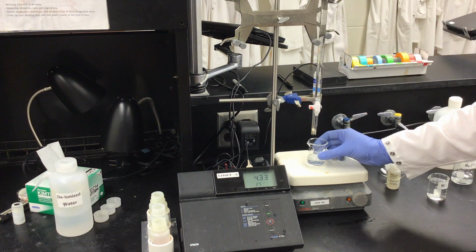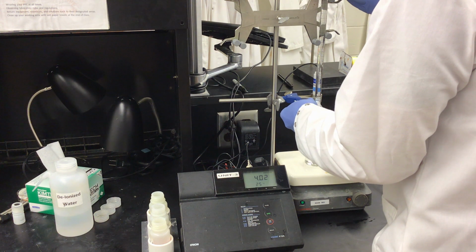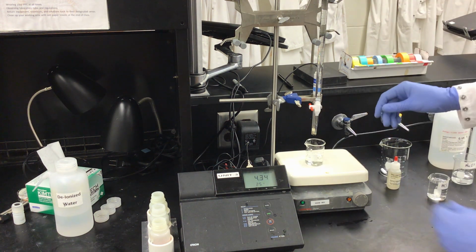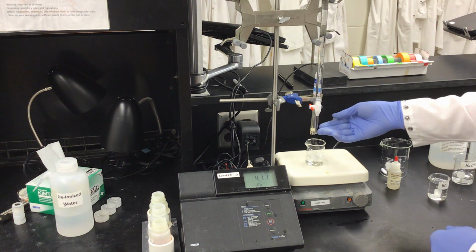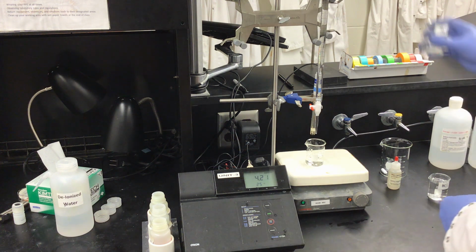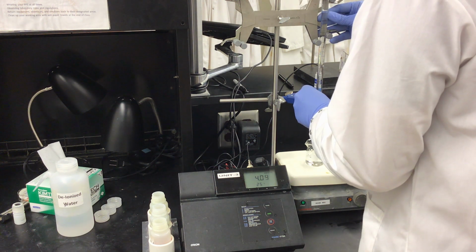So I have my waste beaker here, which I use during my washes. I will go ahead and lower my solution down to the 0 milliliter mark. As you can see, I still have an air bubble caught in the tip, so I need to let solution flow in order to release all the air trapped inside. So now I no longer have any air remaining in my tip. Double checking my volume, I can see that I have gone too low on my sodium hydroxide. So I'll finish topping it back up and then readjusting it back to our 0 mark.